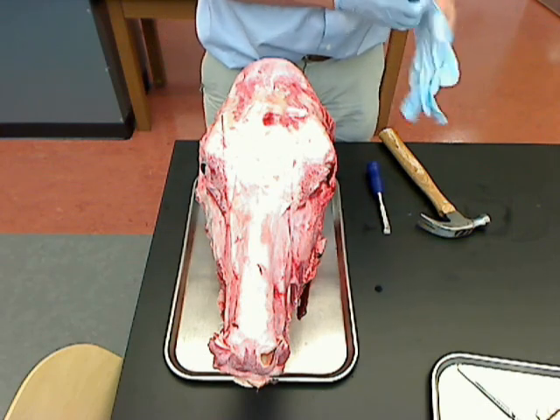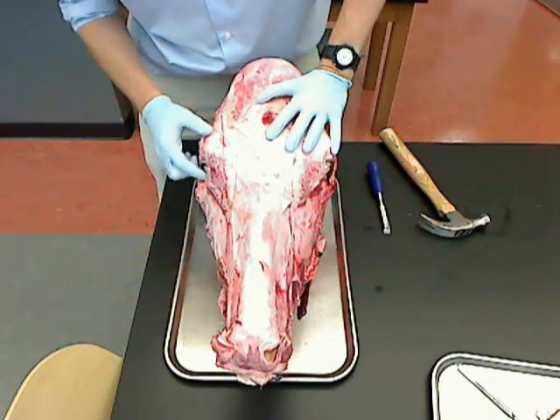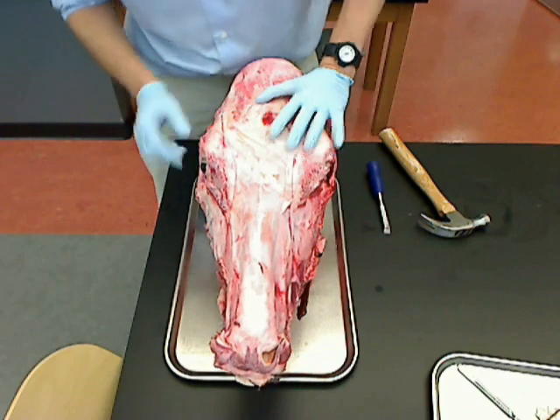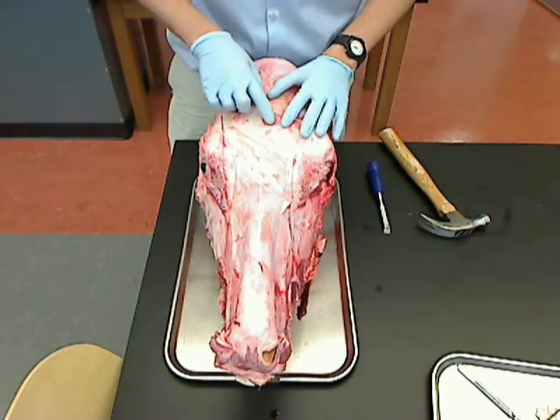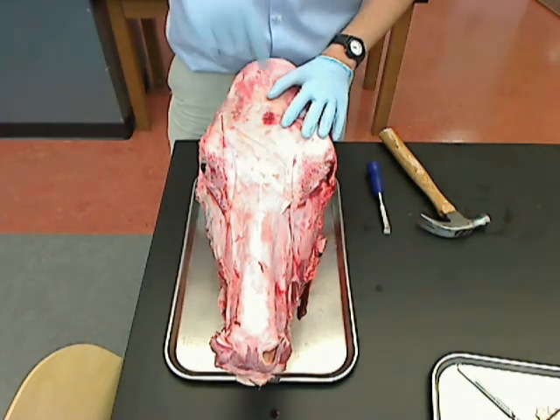This cow's head was recently gotten from a slaughterhouse. You can see it still has its eyes intact, which we'll try and dissect out in a little while. You can also see where the bolt — that I was talking about in class earlier — where that went in.